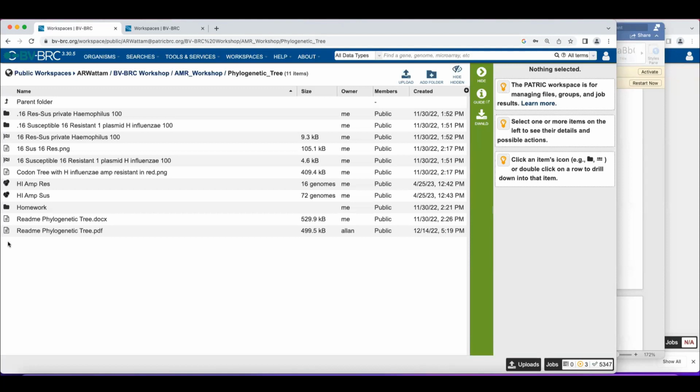And then if you're not into either of those whole genome phylogeny modes, you can do what we call gene trees, where you might have a set of genes and they might have paralogs and homologs from a variety of species, and you might want to do a tree on just the genes per se. So we're going to do bacterial phylogenetic tree right now, phylogenomic tree, so it's the whole genome.